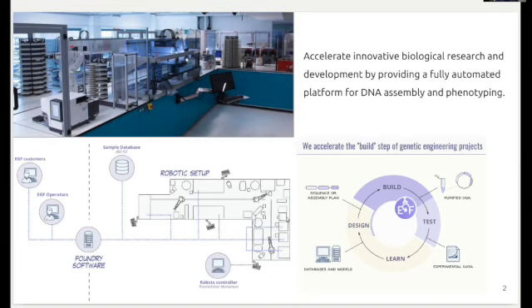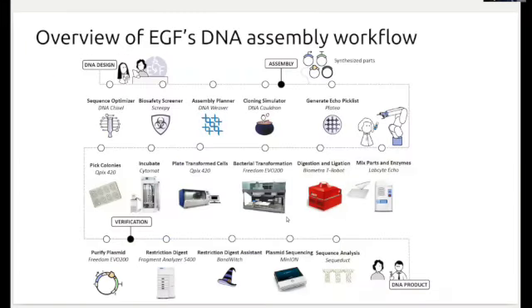And like all other foundries, our goal is to provide a fully automated platform that can scale up and automate processes and build processes for the researchers. As I said, I'm going to explain our workflow and then go into the software side. There are 3 main steps in our main service, which is DNA assembly design from parts. One is the DNA design and the planning of the procedure, then the actual assembly in the lab, and then quality control and verification of the product that we get.